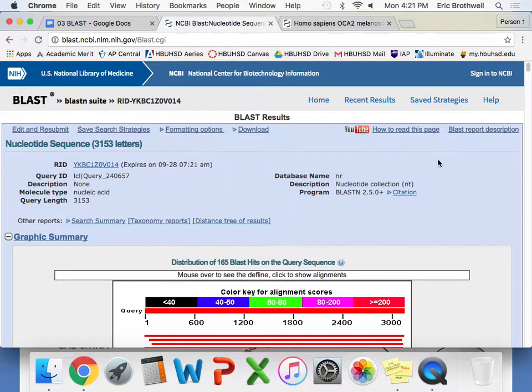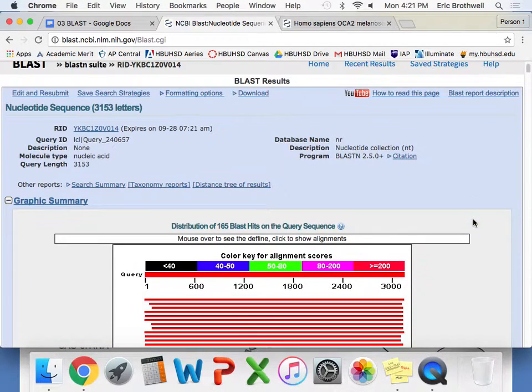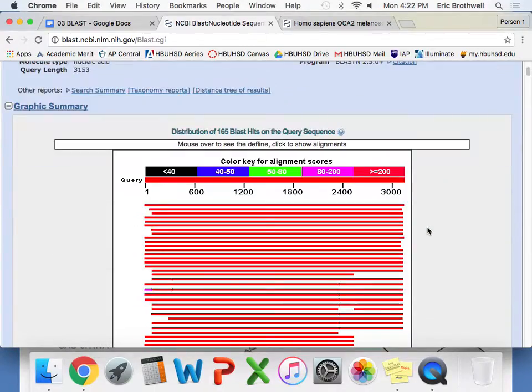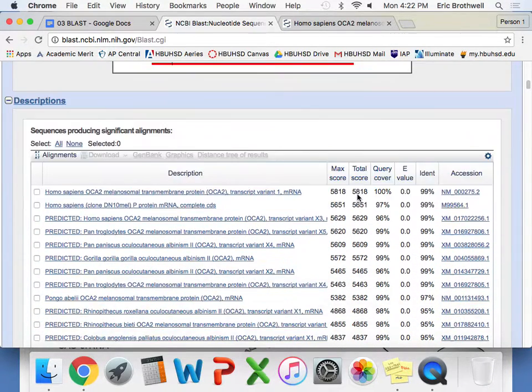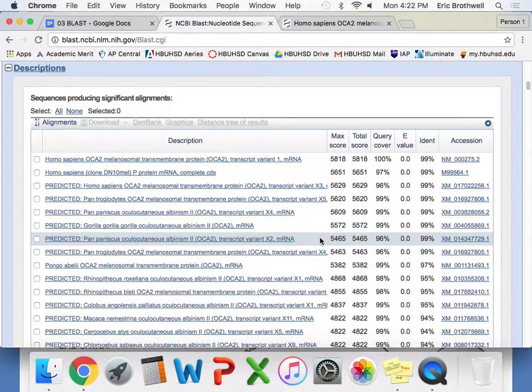That's what I get. And if you feel like it, you can watch how to interpret all of this stuff. I haven't watched this video, but I'm sure it's highly technical. Much like how I haven't read this one either, but I'm sure it's very fun. What I'm going to find is this massive table here under where it says descriptions. This turns out to be where did we have a match?